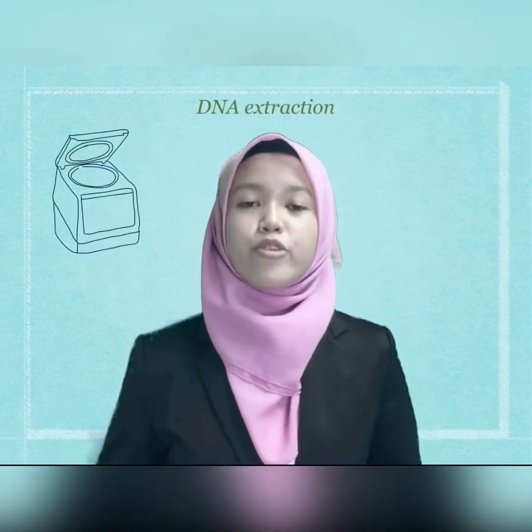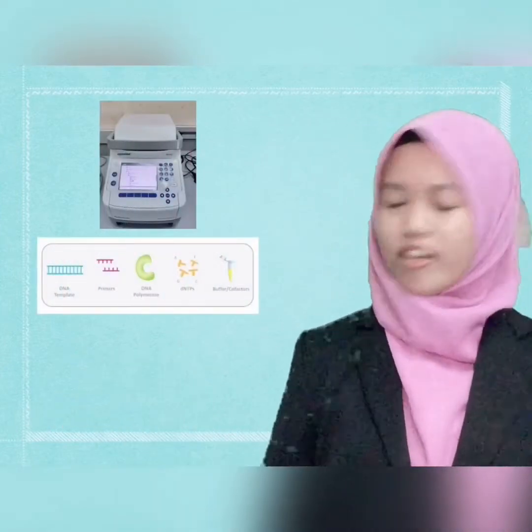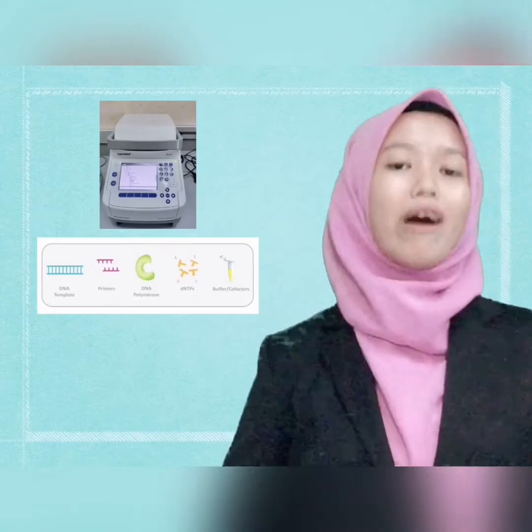Then, we proceed to DNA extraction. Then, we perform PCR amplification. So these are the ingredients. There are DNA template, buffer, primer, and others.